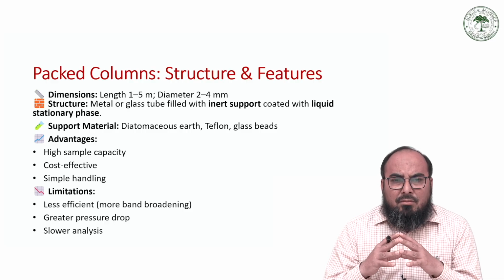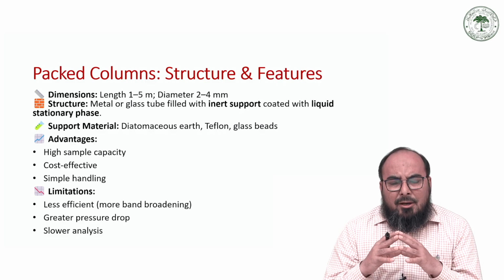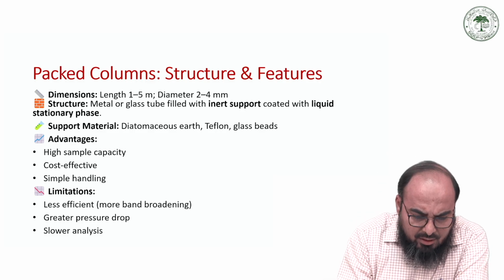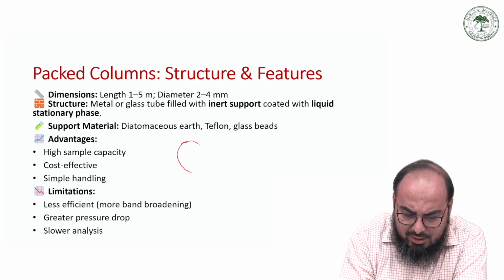The packed column in gas chromatography is actually of two types. Let us get a cross-sectional view of a packed column.